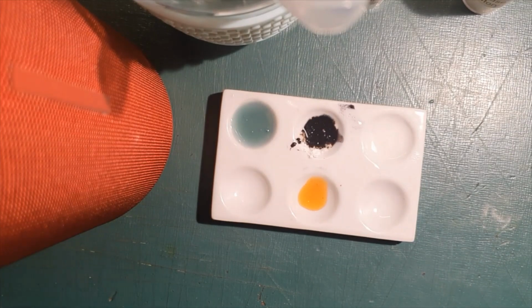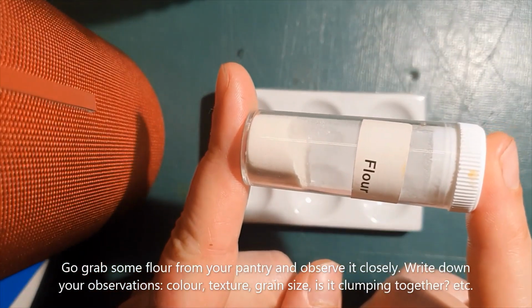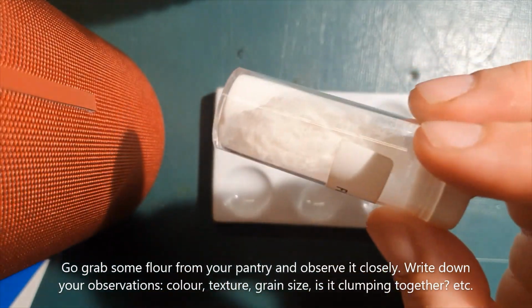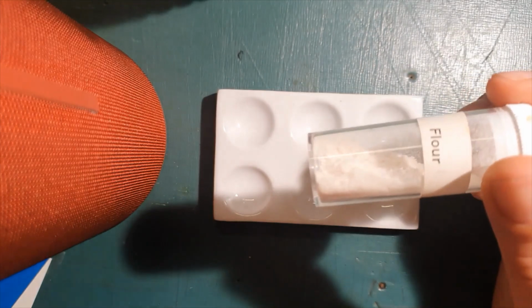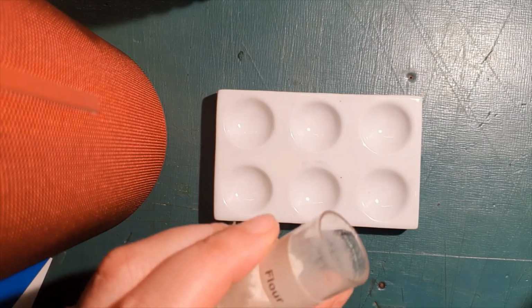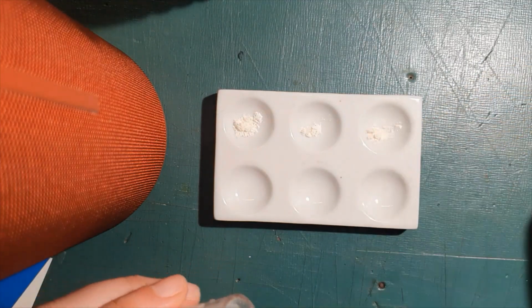Okay. All right, so the next powder we're going to be looking at is flour. Now, I'm assuming you have flour in your home, or you have seen some before, but basically in the appearance section, you need to go look at some flour and write down the appearance and texture, because I'm assuming you have some in your home. All right, let's get testing. I'm going to put some flour in 3 of the wells like we did before.